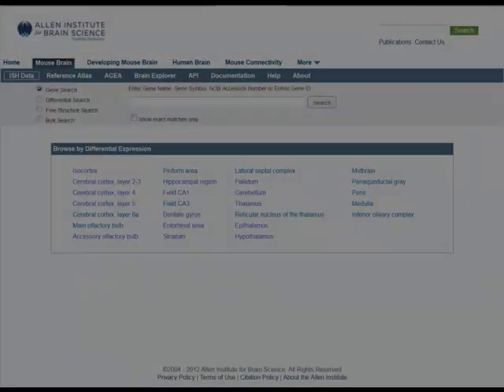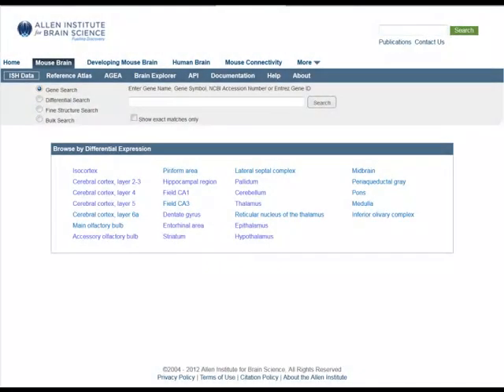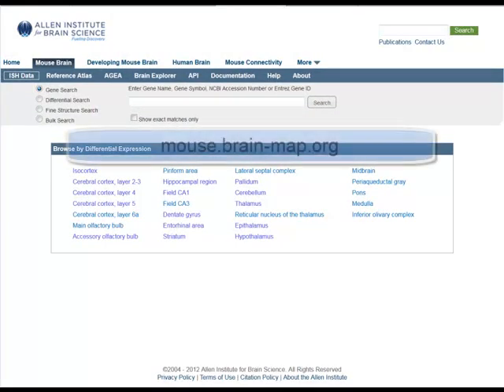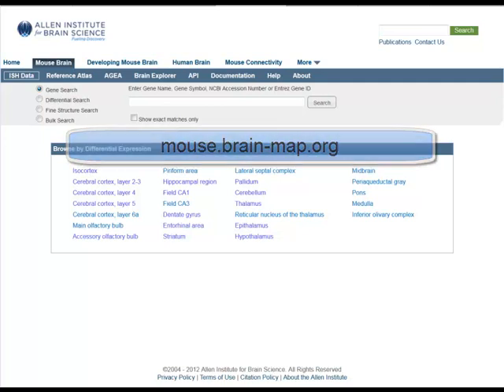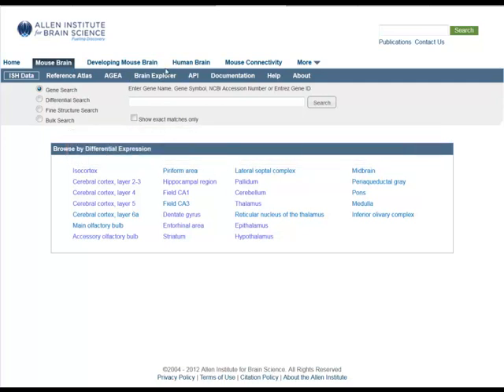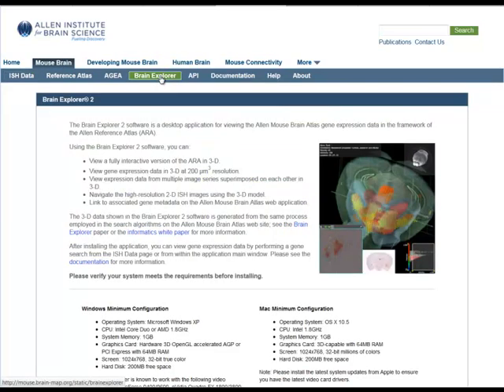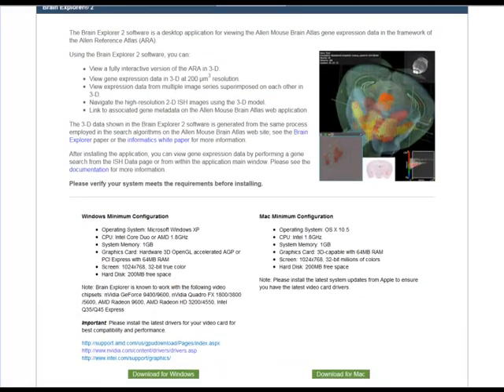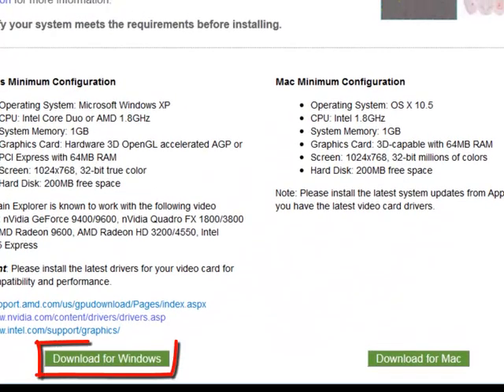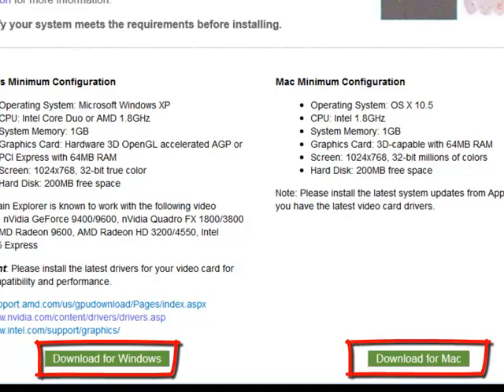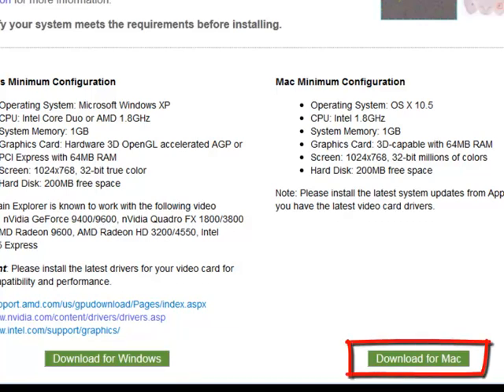The Brain Explorer software is a desktop application designed to view the Allen Mouse Brain Atlas data at mouse.brain-map.org in a three-dimensional framework. You will need to download the software from the Brain Explorer tab in the Allen Mouse Brain Atlas banner. You can download either the Windows or the Macintosh version.